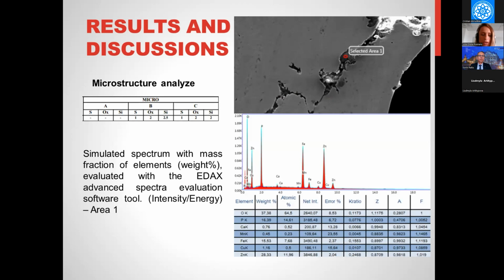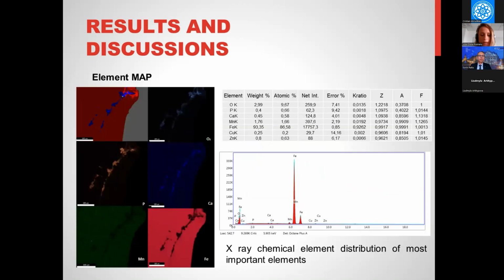The microstructure analysis detects an isolated inclusion with irregular shape and exogenous provenience. The spectrometer is highlighting the peak of each element localized in defected area so that nature inclusions to be identified. Element map analysis is showing the chemical distribution of most important elements in designated area.